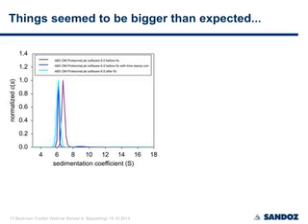So it started with a little problem, which is now fixed by Beckman, and ended up with a quite useful series of methods to improve the reproducibility and also the accuracy of your S values reported from different machines, allowing you direct comparison from lab to lab, or improving it, let's say, in this way.